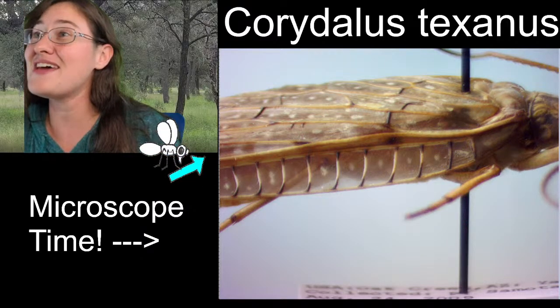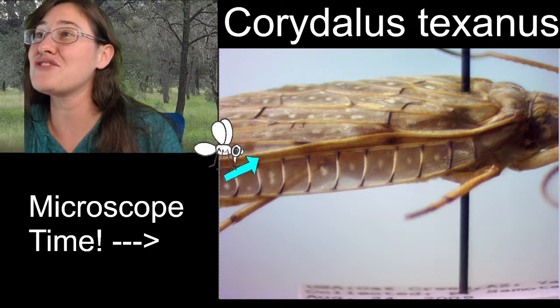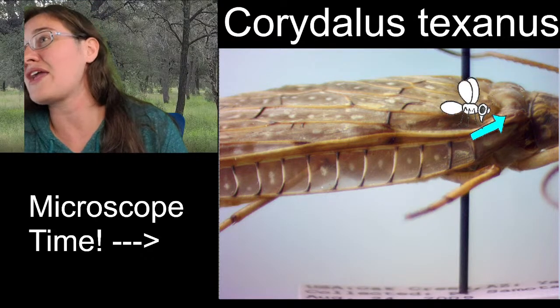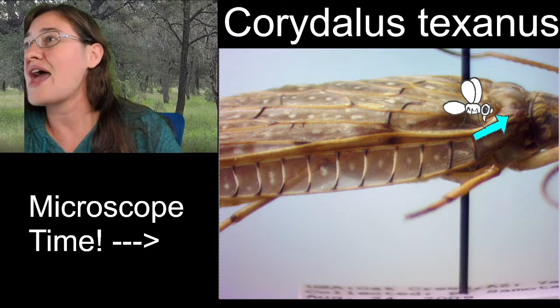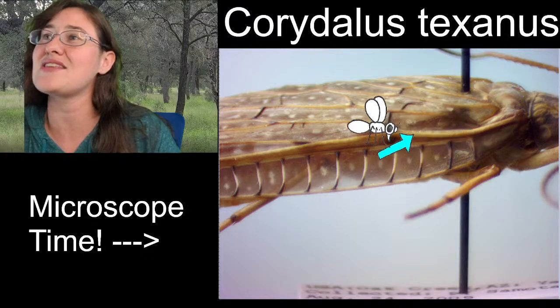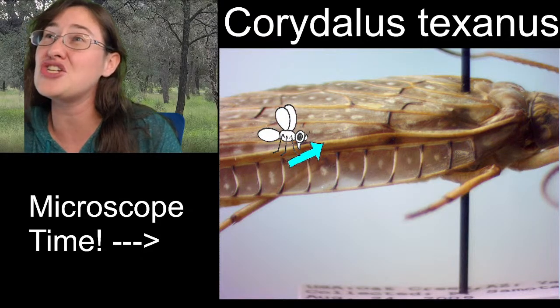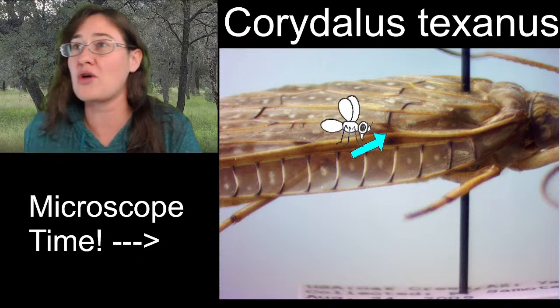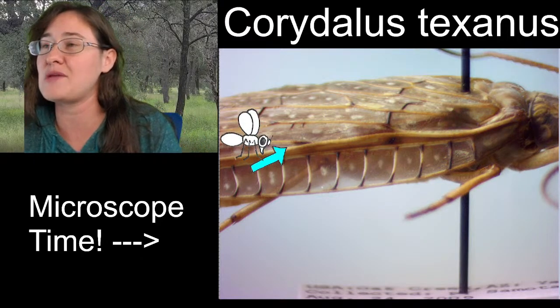But this vein right here is on the front wing, but it not only engages our front wing here, it's this vein here. And it's connected. It looks like this is our leading flight edge is what I would probably call it. That's when our wings open up. This is going to be pretty much in the front.